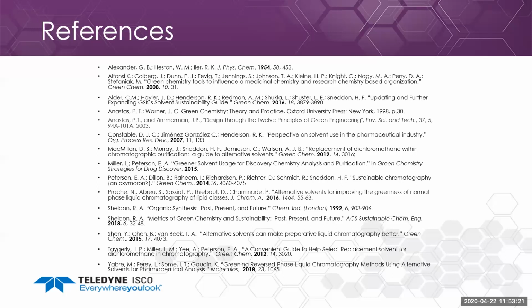A few more questions here. Sorry, just reading them here. One of the questions is how to access the focus gold resolution method in your NextGen 300+. Basically, just load the gold resolution method, the default method, and then you can just change the gradient endpoint. So instead of running from 0 to 100%, change that from 10 to 30. So it's the same length, it's just over a focused range.